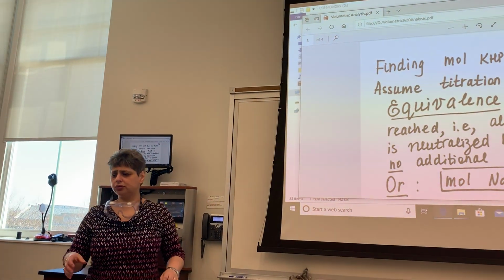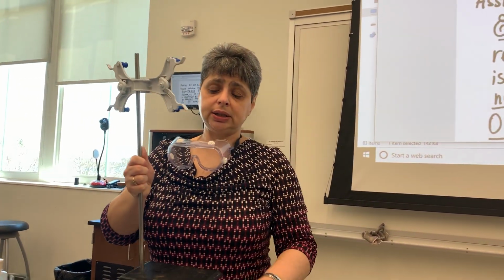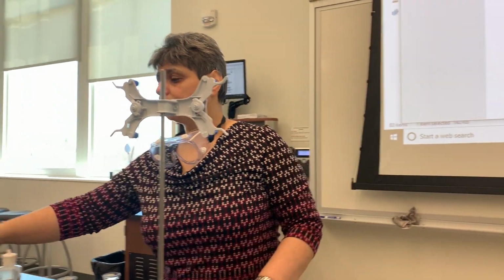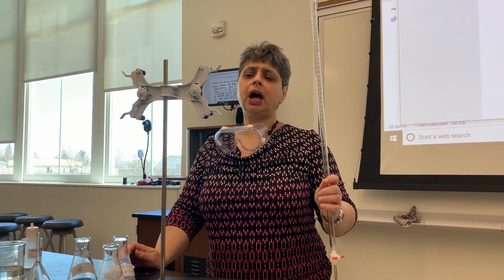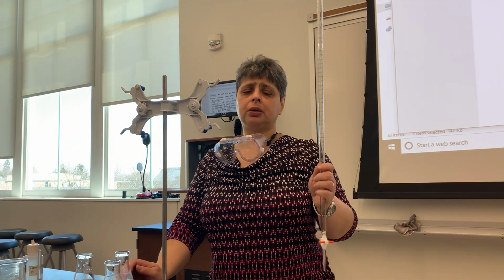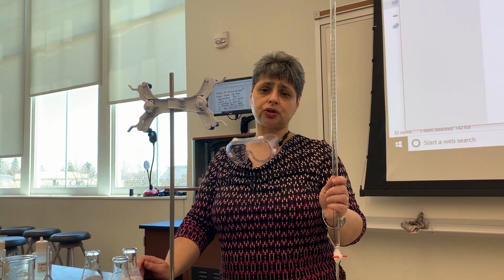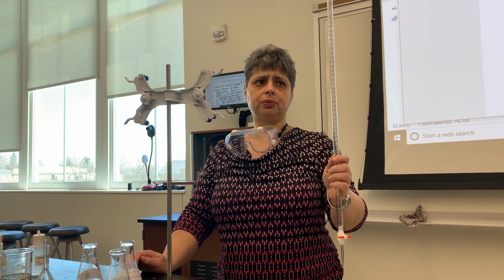I would like to show you several things here real quick. I'd like to point out that I did post several videos on Canvas that talk about use of the burette, preparation of the burette for use, and also guide you step by step through the actual procedure. So I'm not going to show you the procedure, I'm just going to make some important points.